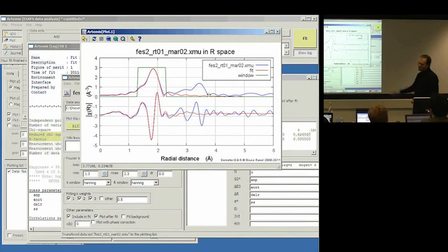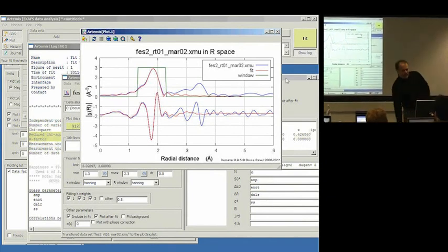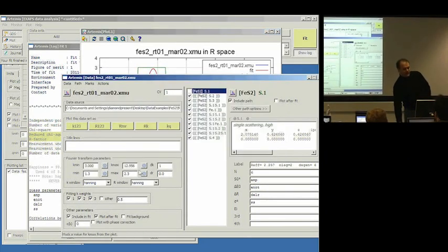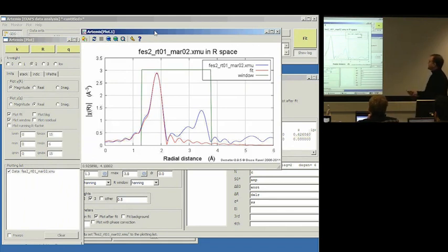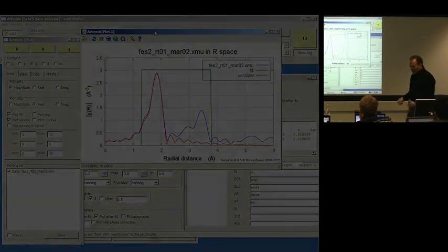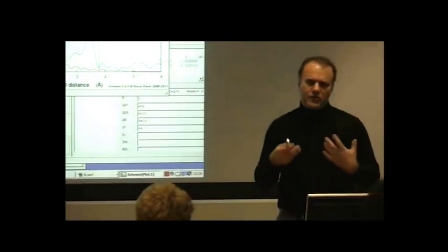So the next phase of analyzing these data is going to involve moving the fitting range out to 3.8. That is, to cover that much of the data. We know from what we saw before that to start to get a handle on this blob of peaks right here, we have to include quite a number of things. So the next small step I'm going to take is to just consider the single scatter rate.